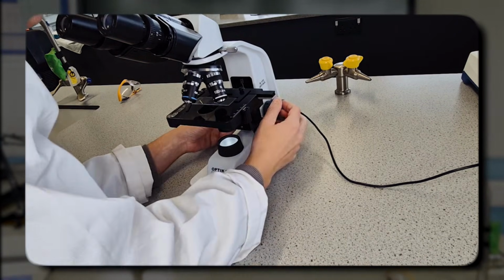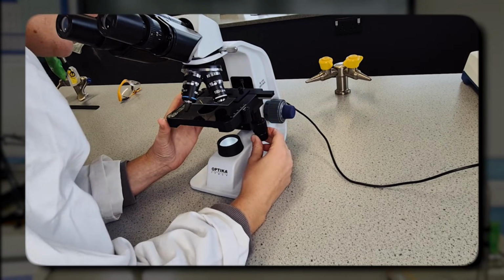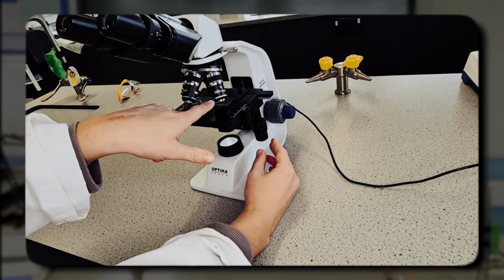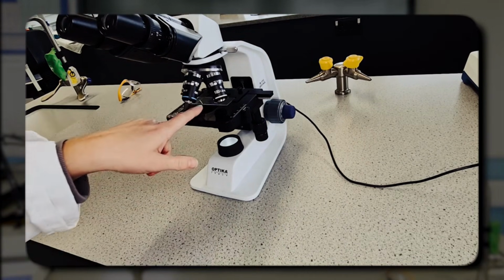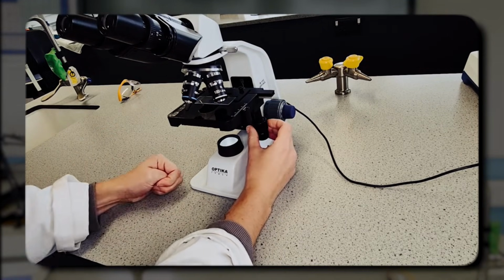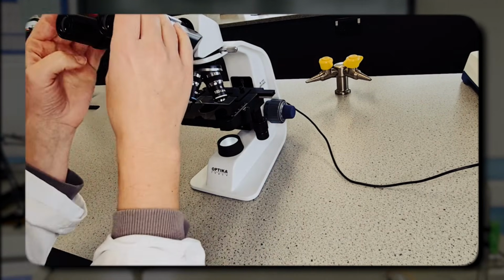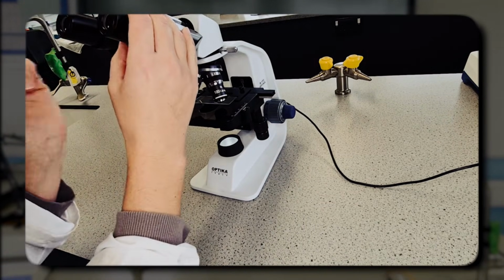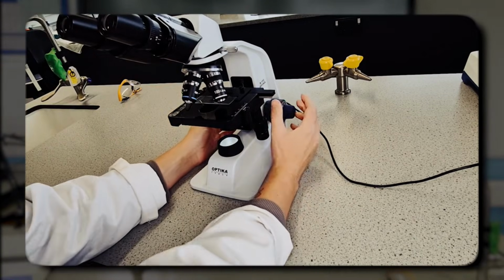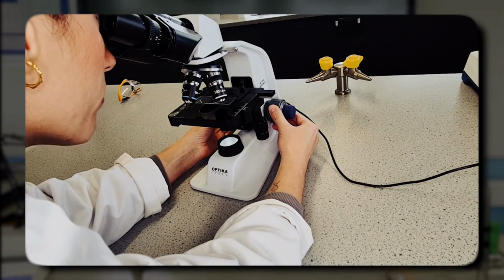And depending on what type of microscope you have, it may be the same level of sophistication, this or not. I've actually got a dial here that I can turn to move my specimen so I can see it's directly under the light, so I know it's going to be in the correct position. So I'm moving it so I can just see that is now in the right position. Then have a look through. And I just need to focus it a bit, and then I'll show you what I'm currently looking at.